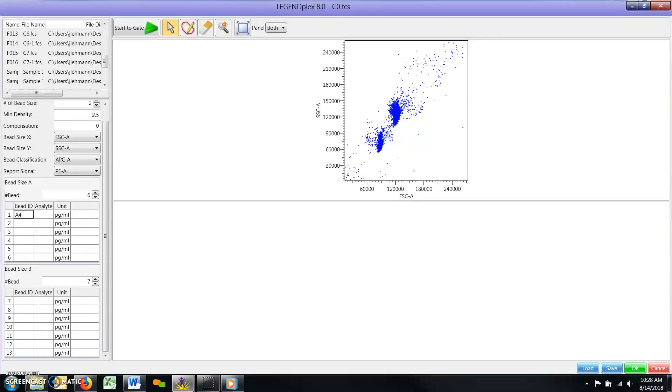Enter the lowest numbered bead ID at the top of the list first, and then fill in the rest of the list sequentially downward.